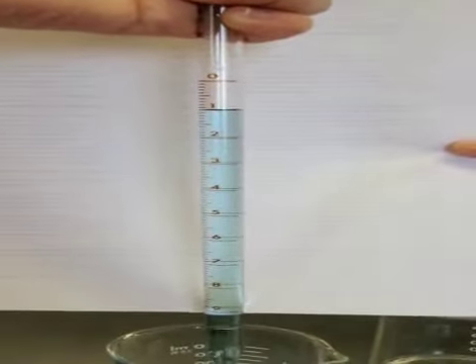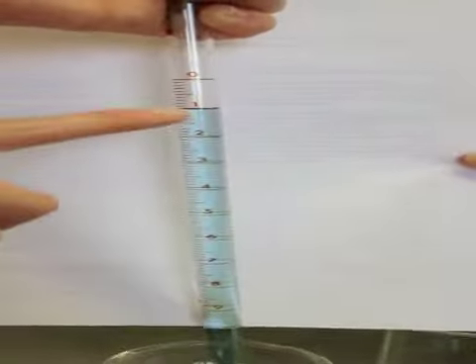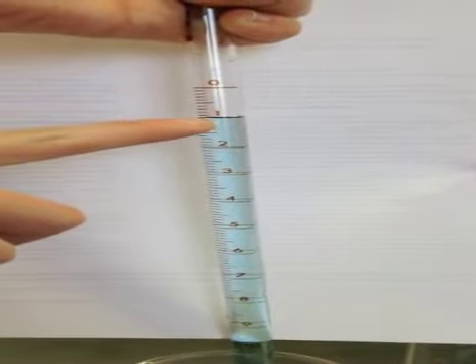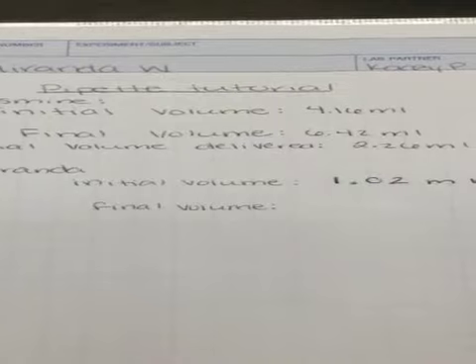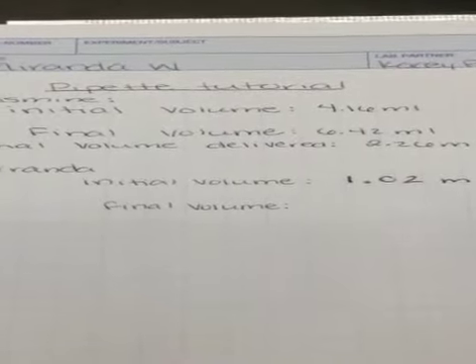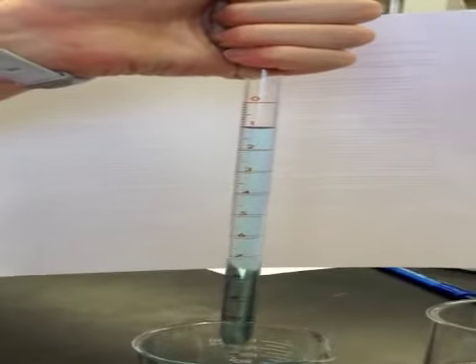The initial volume is 1.02 read from the bottom of the meniscus. The initial volume is 1.02 milliliters. Now I'm going to release some of the liquid.